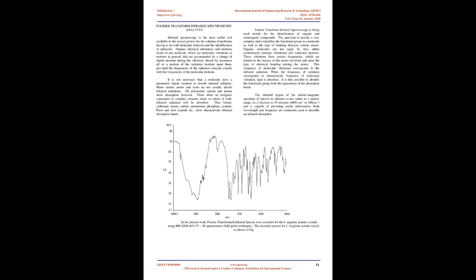The material exhibits a single sharp weight loss starting at 200°C. But below this temperature no weight loss is observed. Hence the crystal is completely devoid of any inclusion of water. Hence the compound is found to be stable up to 200°C. TGA analysis of the arginine crystal.